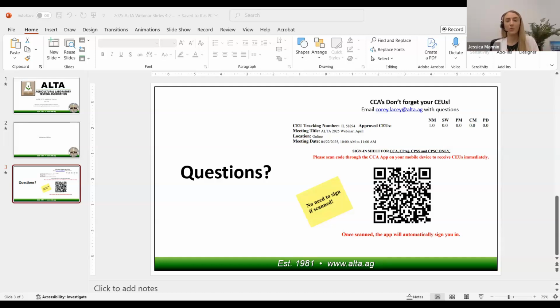So internally here at Elementar, when we're analyzing pure chemical reference standards that have a known concentration as well as a known combustibility, we always say under 0.1 absolute standard deviation is our basic requirement, just to ensure proper instrument operation and to be able to extrapolate replicates from one another. And so I'd be curious to hear if Bob has a recommendation because just looking at the charts here, I would say most of them are under that 0.1 absolute mark, which would mean looks like anywhere from 0.5 millimeters and below for any sample size was able to provide that precision, which meets our internal specifications.